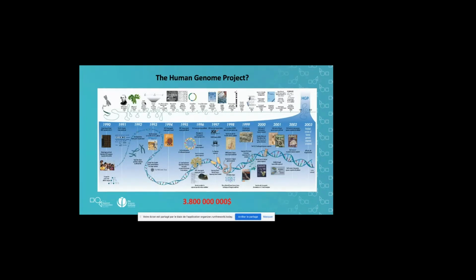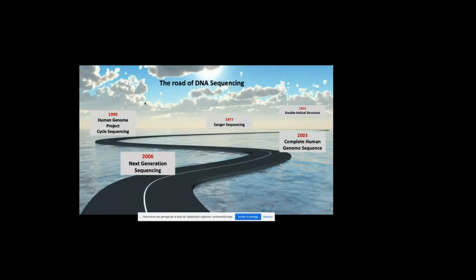So after unraveling this first sequence of this molecule, attention was paid to how to get this sequence a second time, but cheaply and quickly. And this goal was made possible with the introduction of next generation sequencing in 2006.